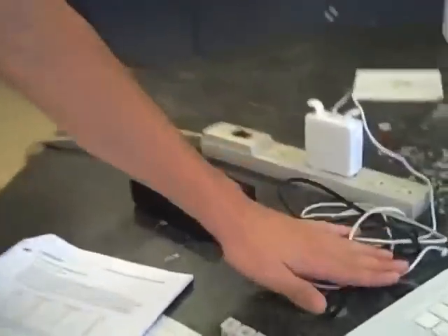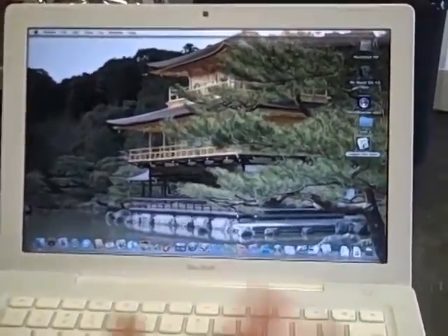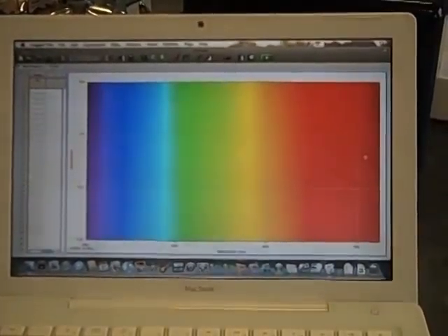Okay, we are going to start. We have our spectrometer, not a calorimeter, so we're going to start, and it's plugged in, and now we're going to go to Logger Pro, which is on our desktop right now, and that opens up, and at first it says no device connected, but that should change soon. That's fine. Alright, and there we go.